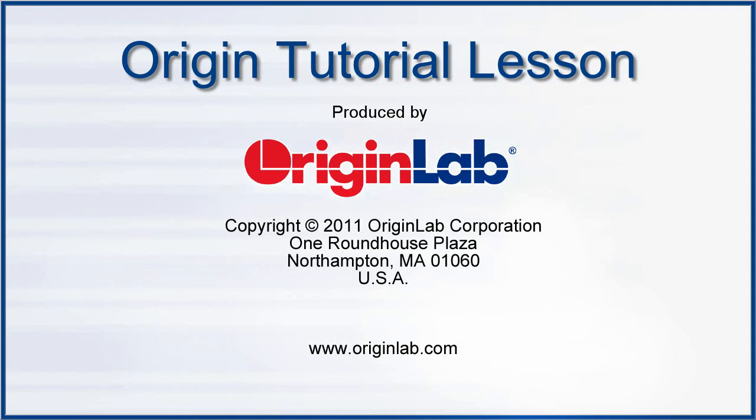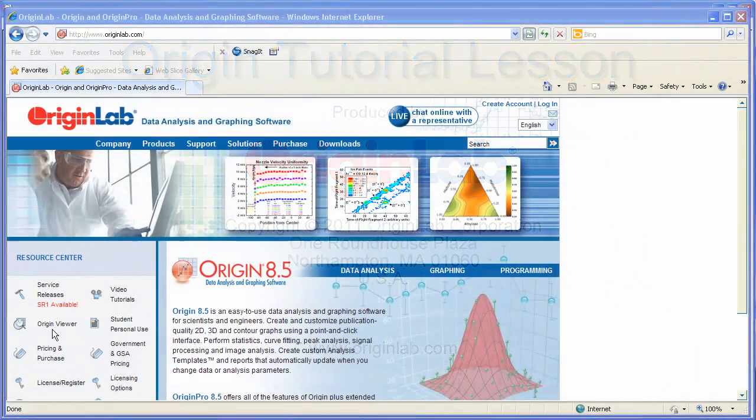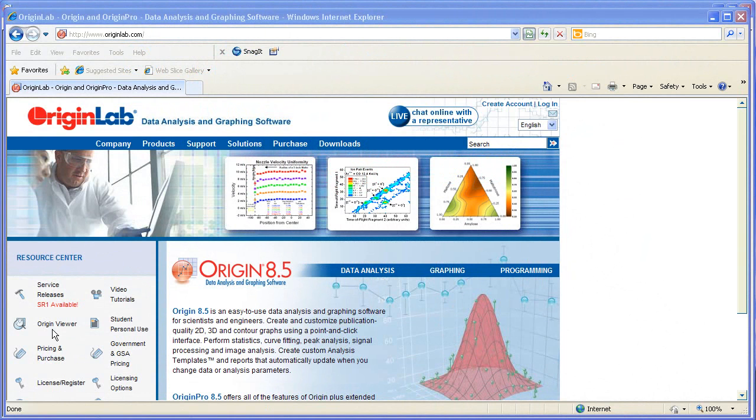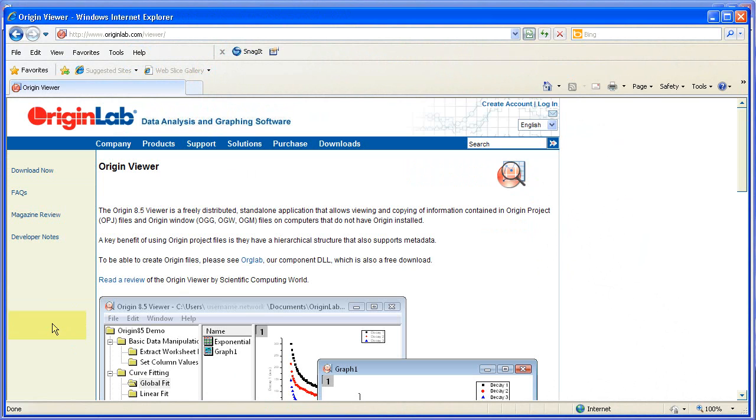The Origin 8.5 Viewer is a freely distributed, stand-alone application that allows viewing and copying, but not editing, of Origin Project or OPJ files and Origin Window files such as OGG, OGW, and OGM files.